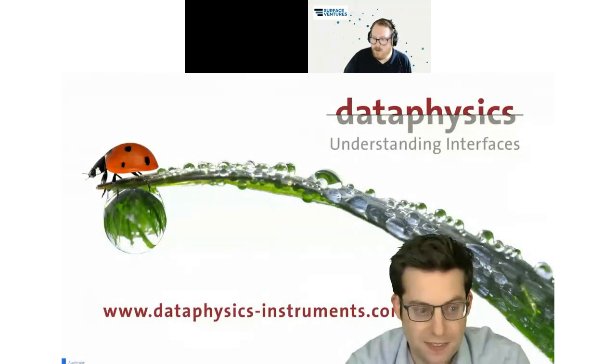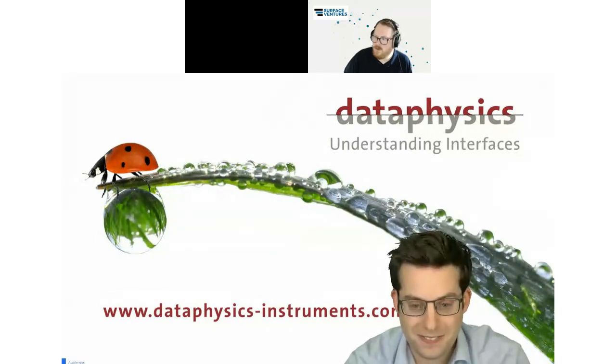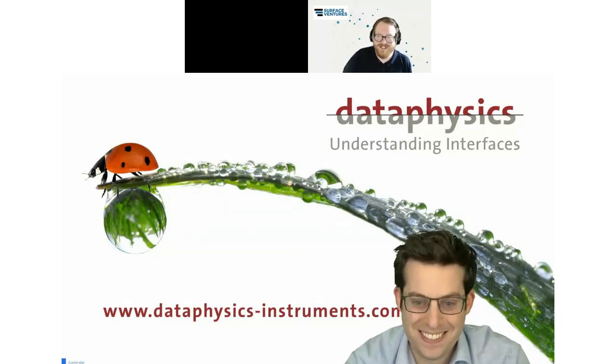Brilliant. Okay, sorry, let me just scroll to the next question. Are liquid densities important in surface energy measurements? I think we already covered this pretty much, but yeah, pretty much not really is basically the short of it.